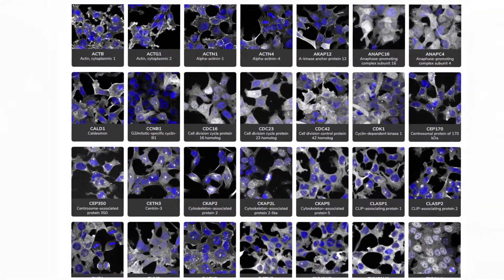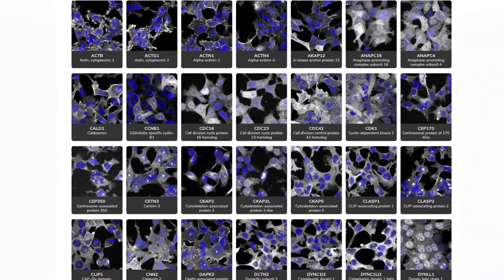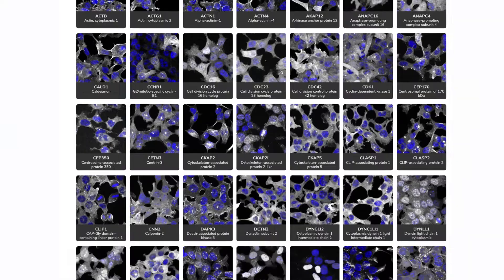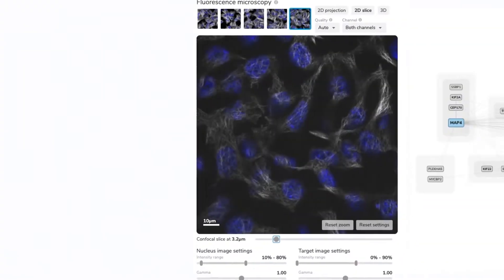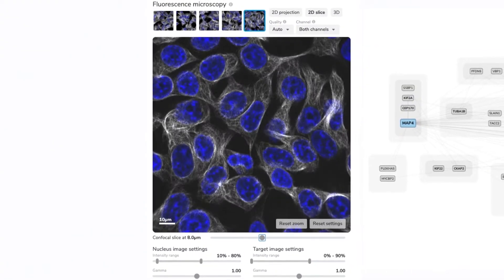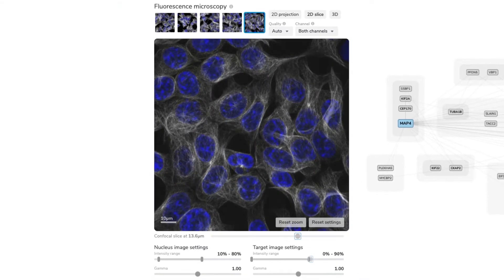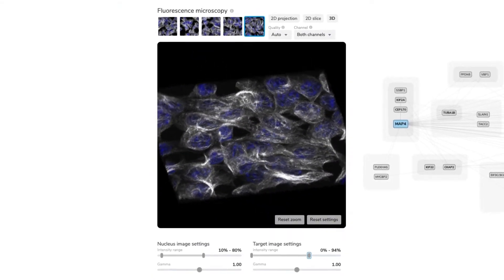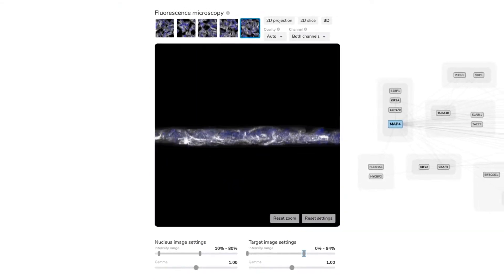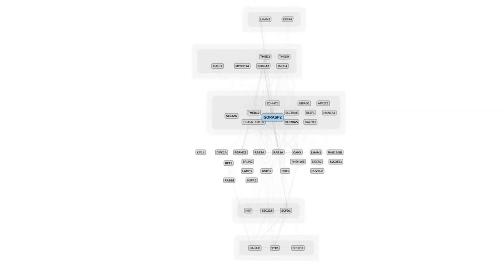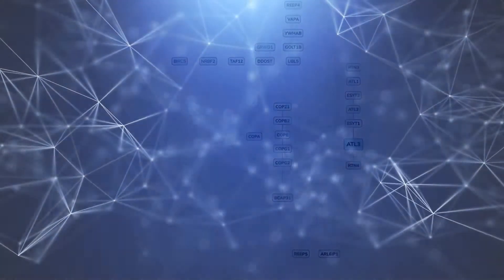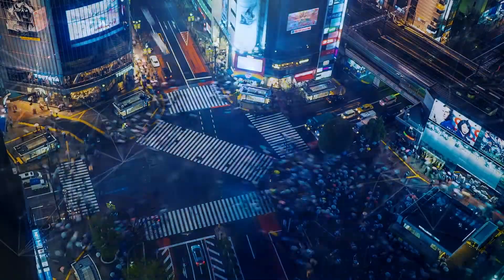The Open Cell platform provides vast, accessible protein localization data collected from live cells, visualized in three dimensions. It also measures the molecular interactions that exist between proteins, displaying the intricate interconnections that form the canvas of life.